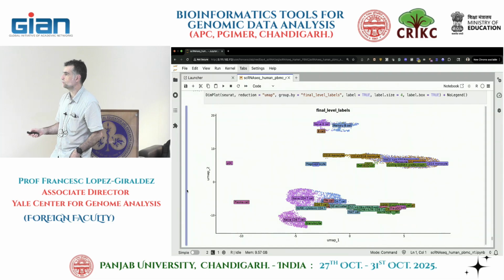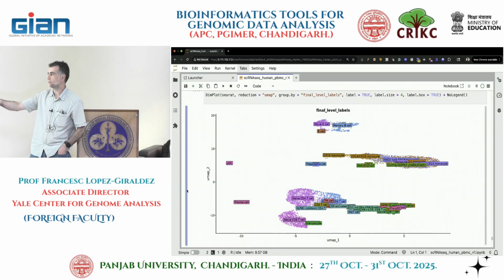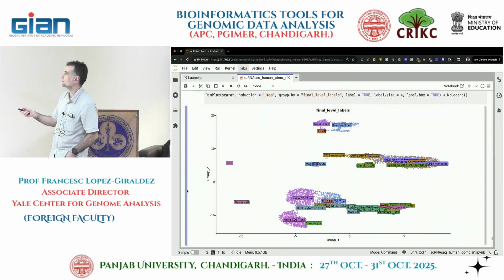So this one also CD4, B cells. Yeah, NK cells are here, right? They're still here. Yeah. So here it gives a mixed result. Definitely monocytes and something else. Oh, a different type of monocyte. So yeah.